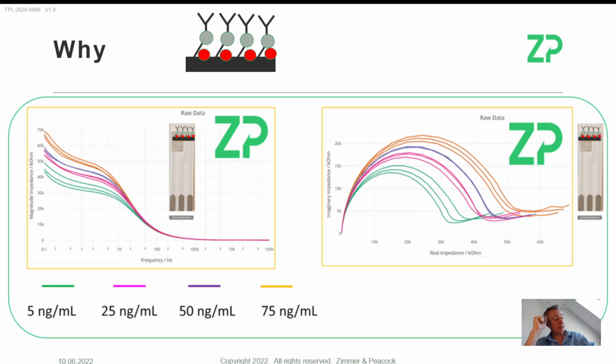There's also now an increase in molecular assays. There are a lot of assays in the literature for SARS-CoV-2 where they're looking for the genetic material from the virus. They've immobilized a capture strand on the surface, and when these two things bind, we get a signal. So impedance spectroscopy is very good at molecular assays and immunoassays, and the reason you should care about them is that these are the kind of assays that help in human health, for example. Impedance spectroscopy is often taught for the sake of impedance spectroscopy.